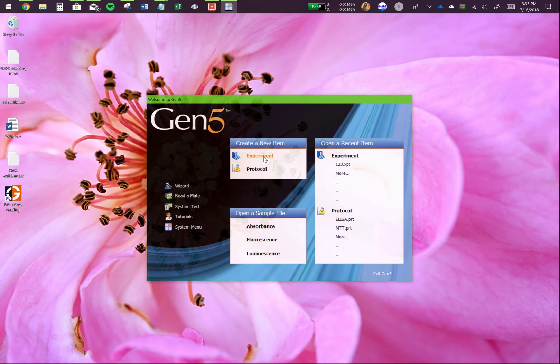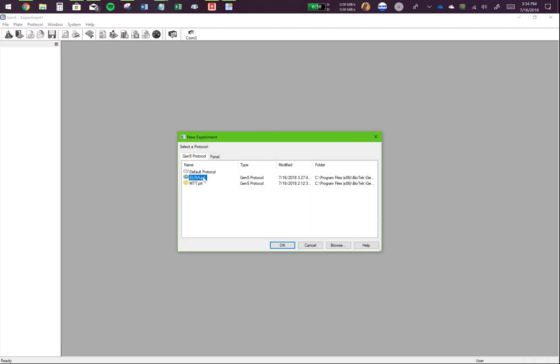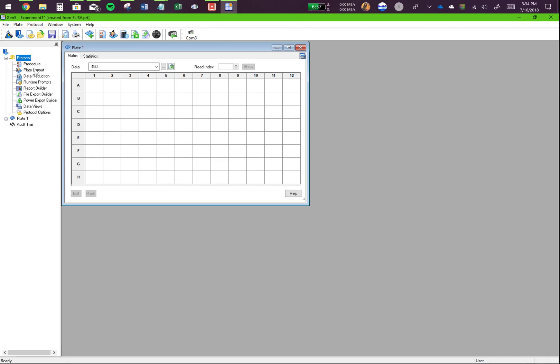So let's click on experiment. You can tell the program which protocol you want to use. Let's say I want to run an analyzer. Then, I'll go to protocol and plate layout.